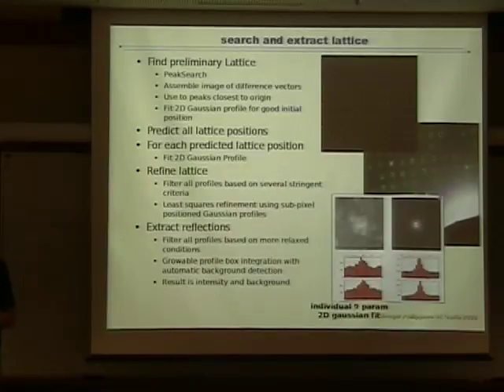So do you have a chance to actually then go in manually and say, this and these are two, and this is the spot for this? Absolutely. In the demonstration afterwards, I will show that each of these steps has a mode where you go in, you look at the stuff, and if you don't like it, graphically you just shift it around and say this is the new lattice. And then, because this was my next question, if you have a screw axis and you're missing 0, 1, then you miss the spot. Yes, exactly. So no, you don't.